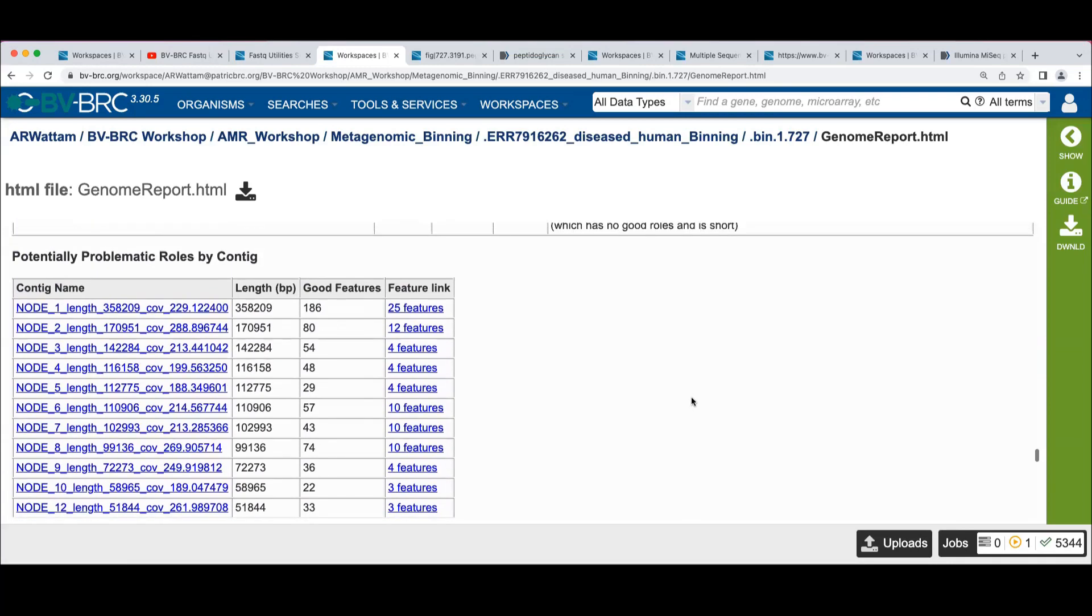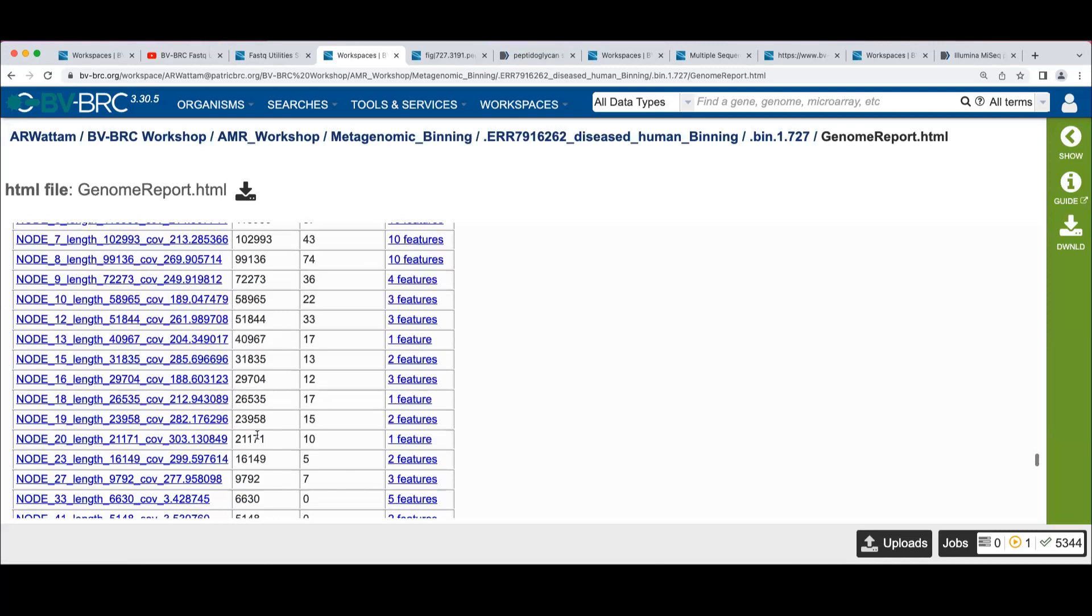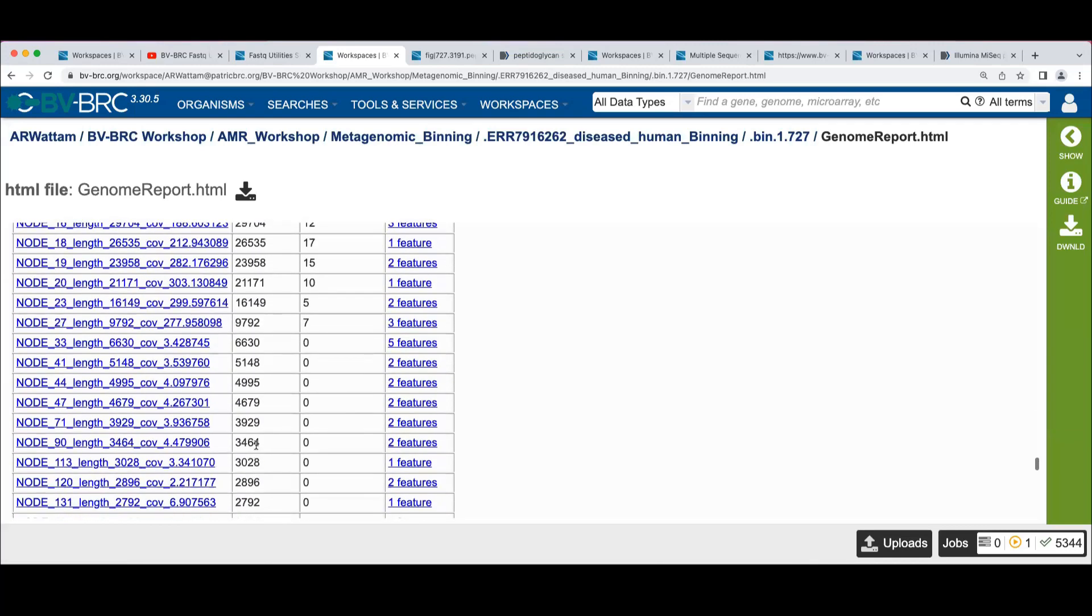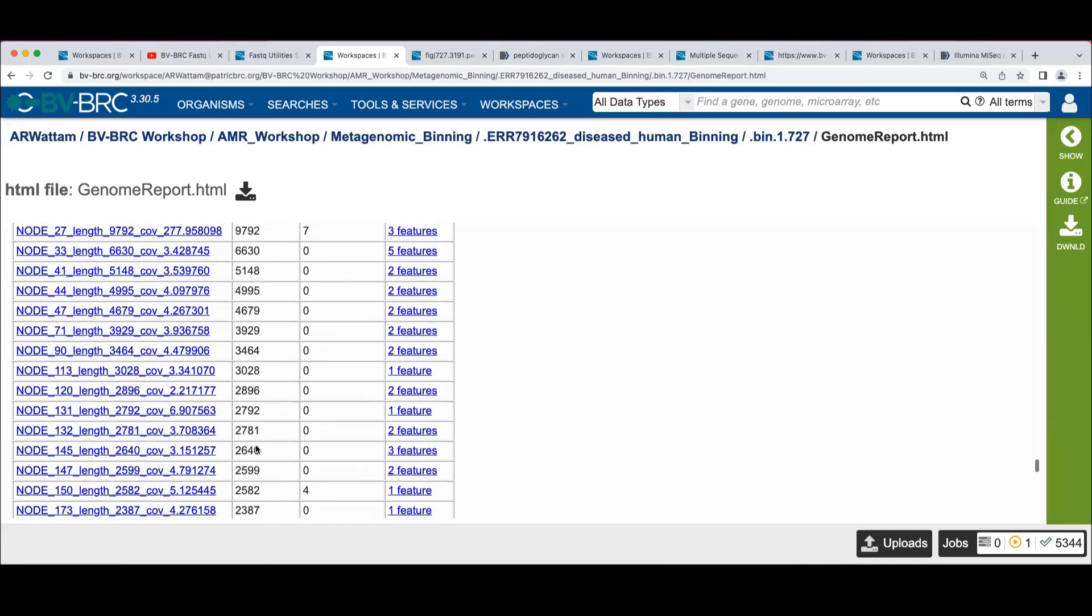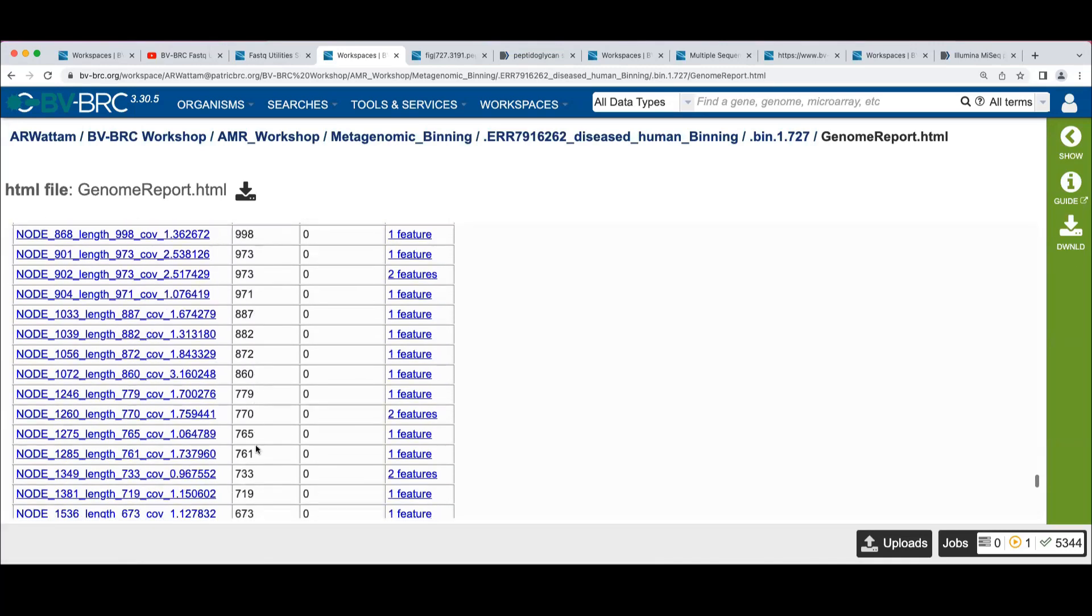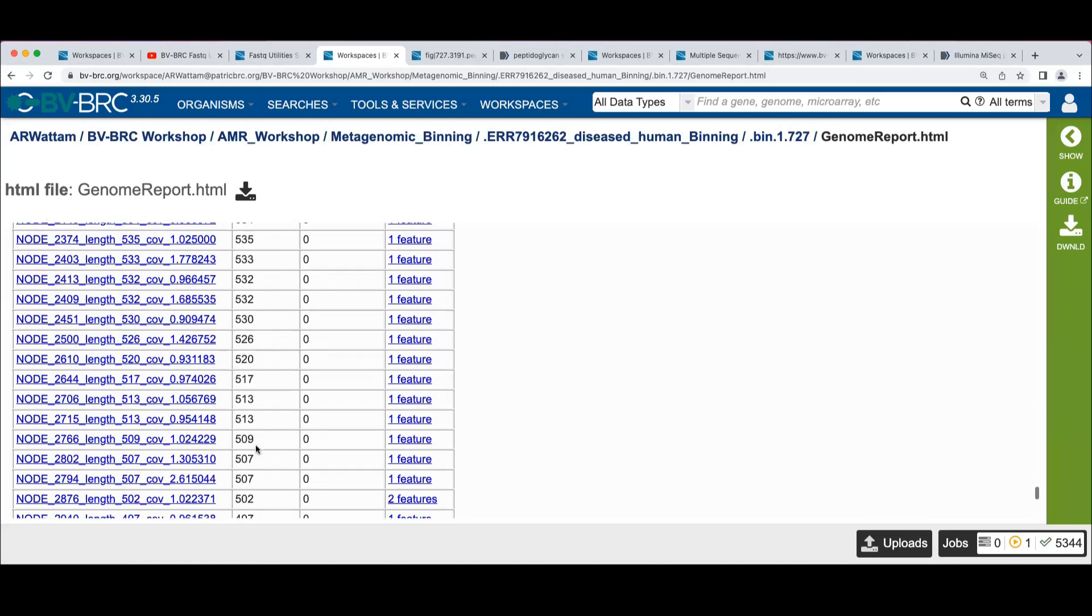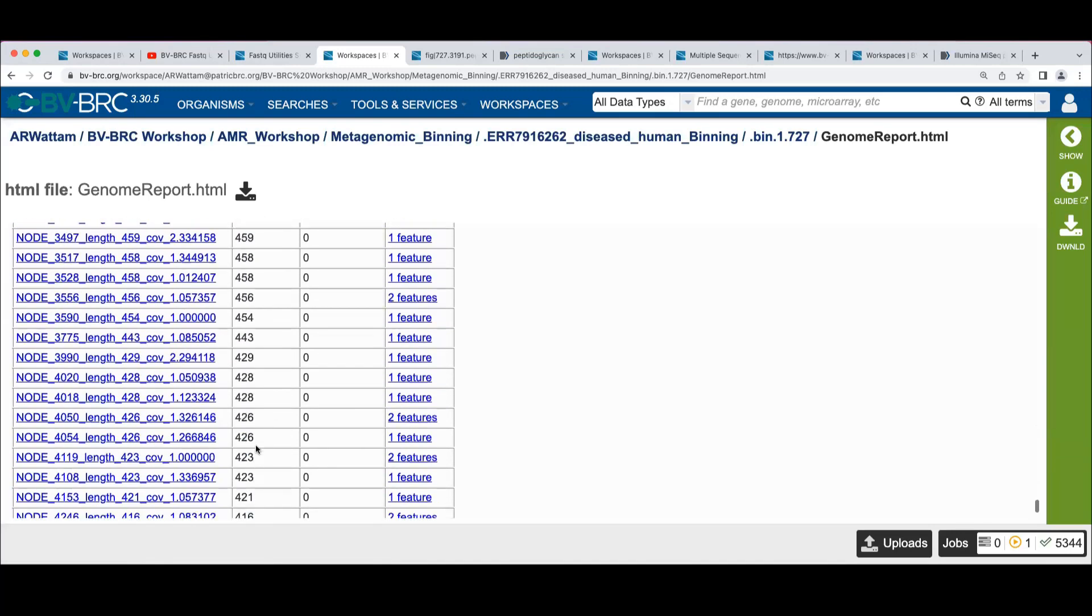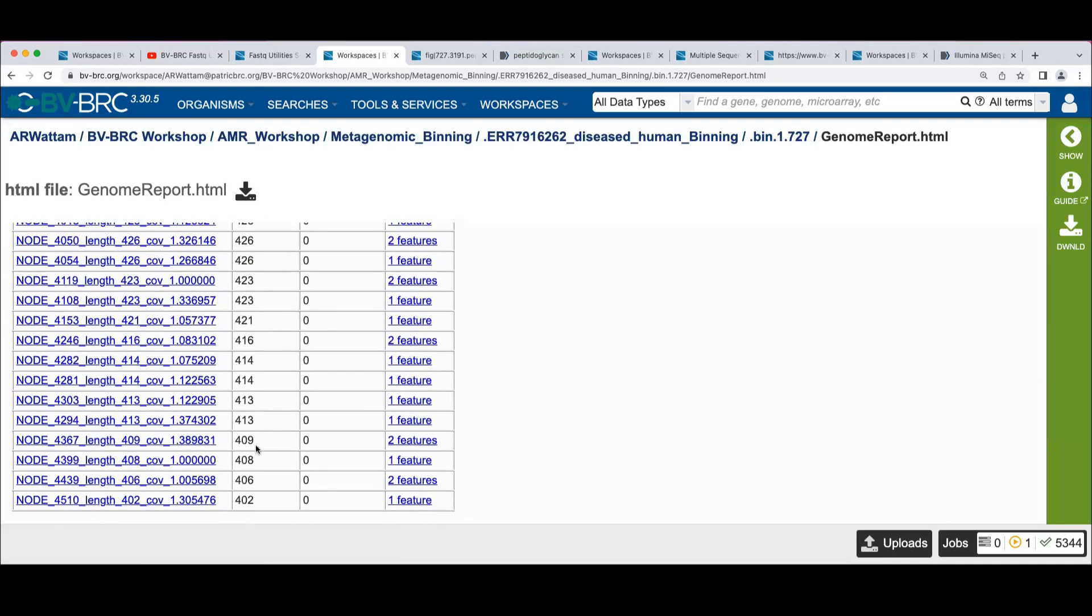Last thing on this page, I was going to point out that there's this other summary of the problematic roles that on a per contig basis, you can see for each contig how long it is and how many good quality features are on there. And we've got this tail here that there's no good features on.